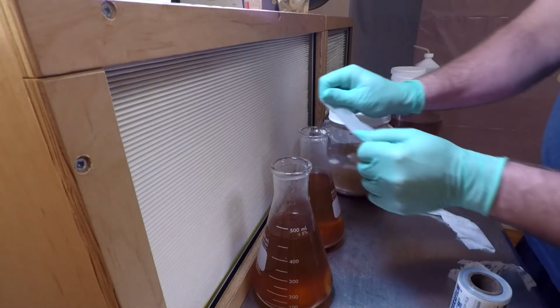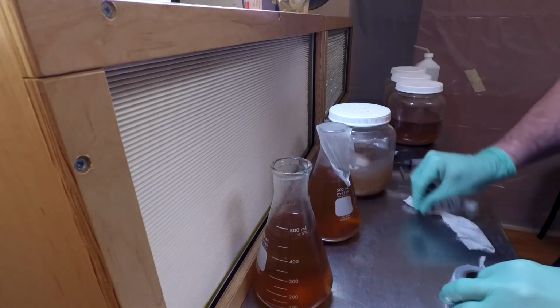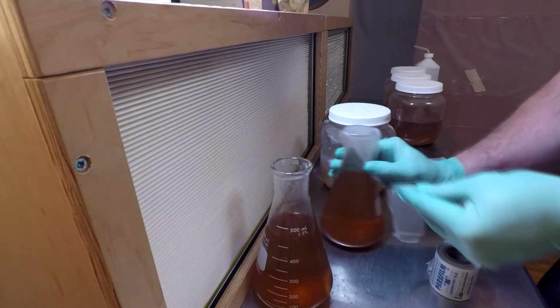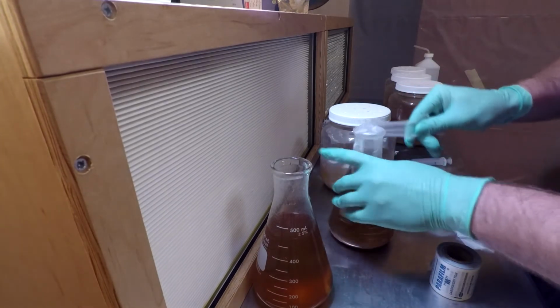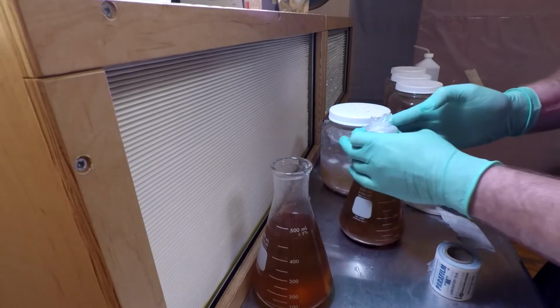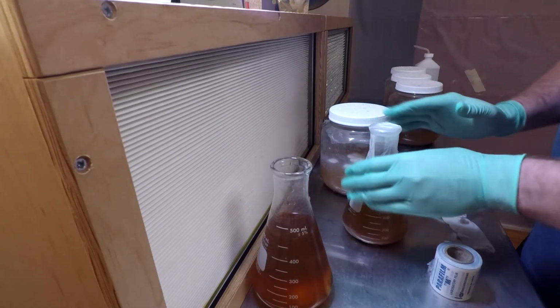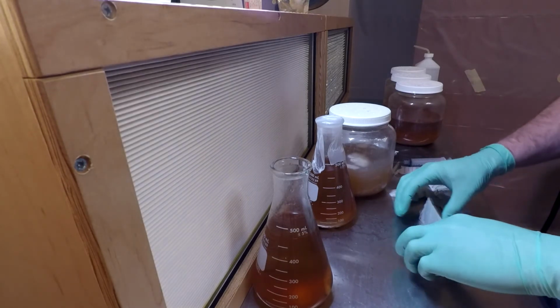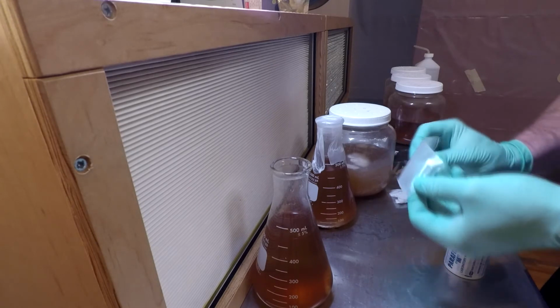One sheet and stretch it over tight like that. Take a second piece. Go around that part. That'll seal it well. Just kind of press it all together. It'll let it breathe enough too. And of course, I have stirrer bars in these as well, so I won't need to shake it up. It'll stir up like the jars. And the nice thing about an Erlenmeyer flask is that when you stir it, it doesn't slosh up real bad.